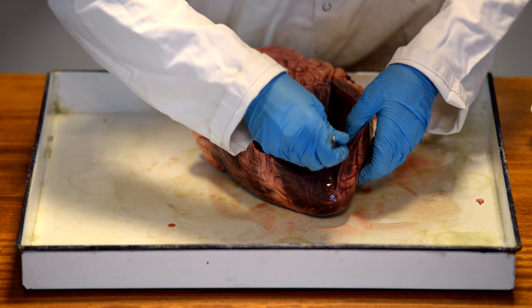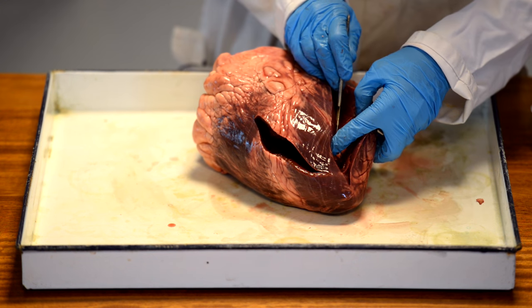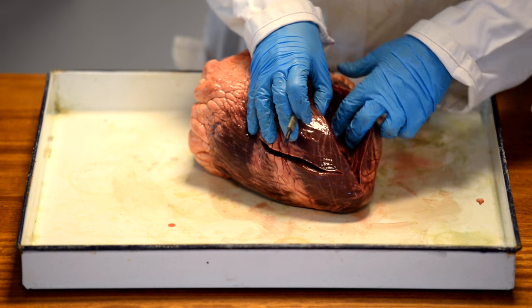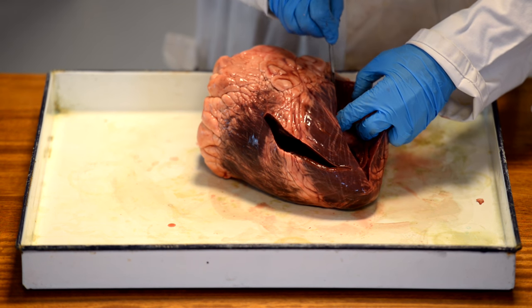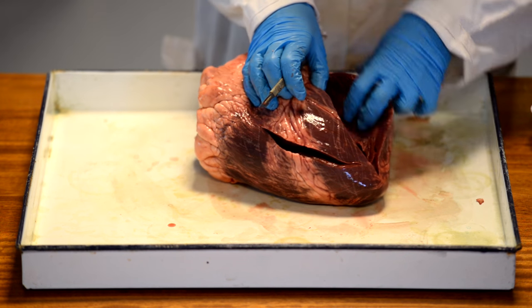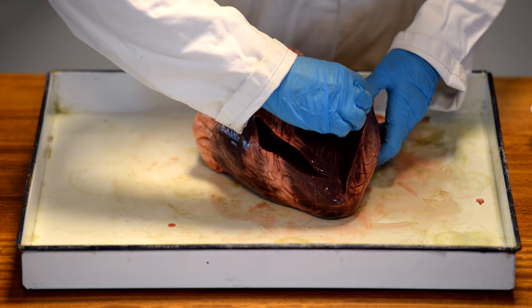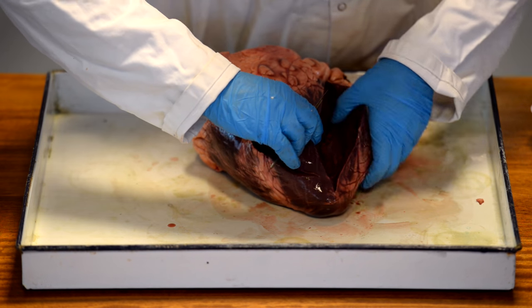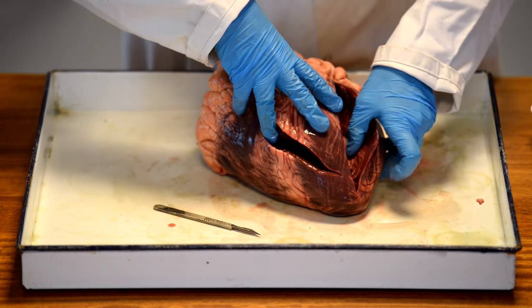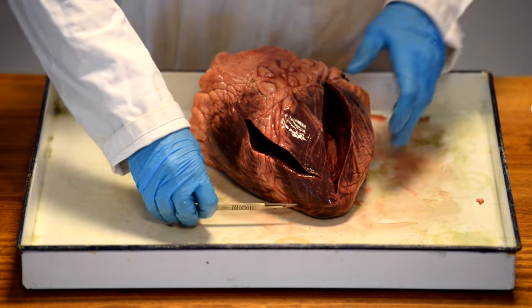Still got a little way to go. Just to give you an idea of the thickness of that muscle on that side of the heart. Here we are, getting there. Now, with the smaller hearts, this isn't anywhere near such a long job to get all the way in. But now, if I just go a little bit further, you should be able to see that I am opening up a cavity with massive thickness of walls. So a long way into that.